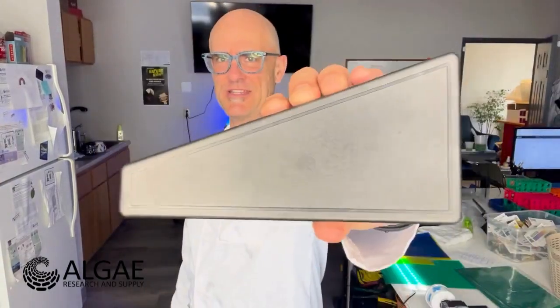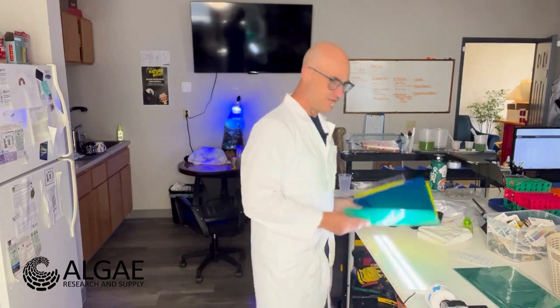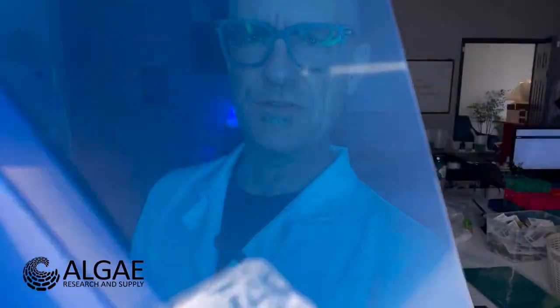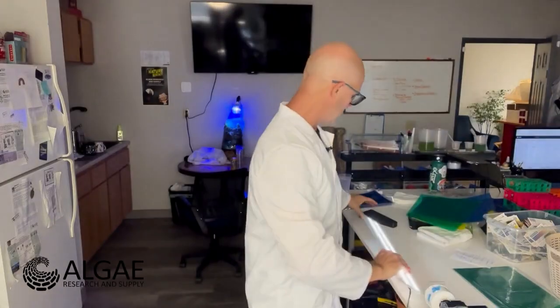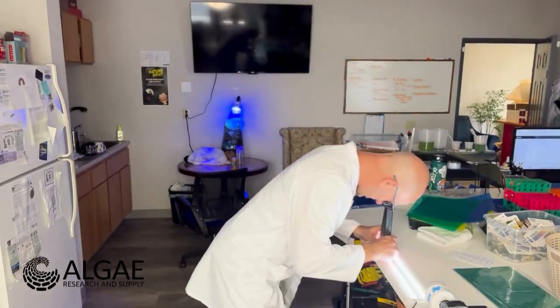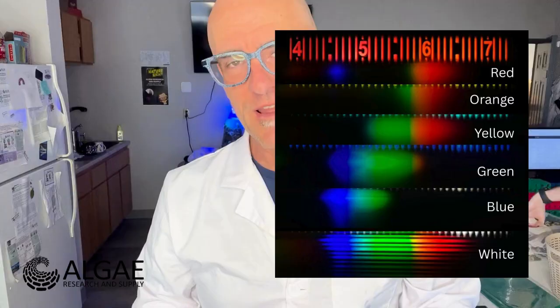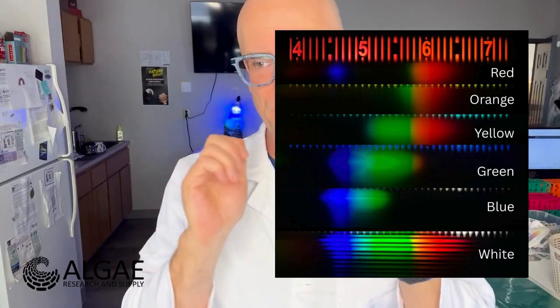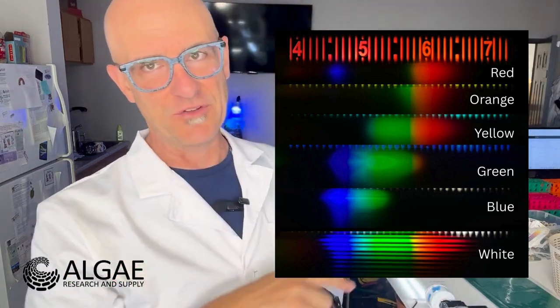Okay, so we have this, which is the spectrometer, which has the diffraction grating in it. And I have used all of these fine different colors here to get different wavelengths out and put them in front of our benchtop light as you see it. And then I've sat here like this to look straight down into it. And I have come up with these spectrums. Woo, spectrums, you can see them, all the different ones that are there. And from that, now we have the relative amount of photons which are coming in at which wavelength as a function of the filter.